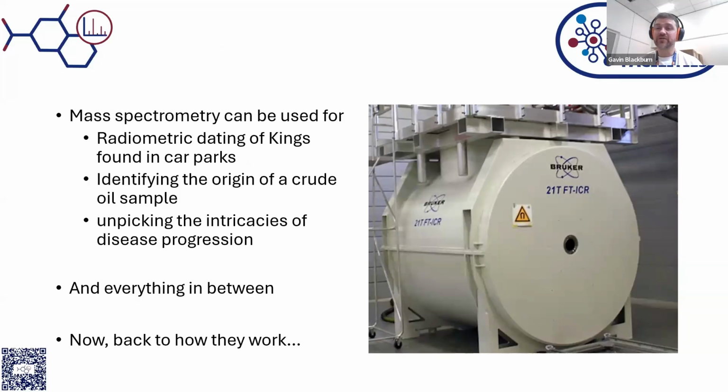You can apply these instruments to anything. And that's, to me, really, really exciting. But it does mean that you need to understand how these instruments work, unsurprisingly. These aren't sequencers where you're detecting a very, very small number of compounds, even if you're reading to really, really deep levels and having to use really, really intricate, complicated machinery to be able to do that.